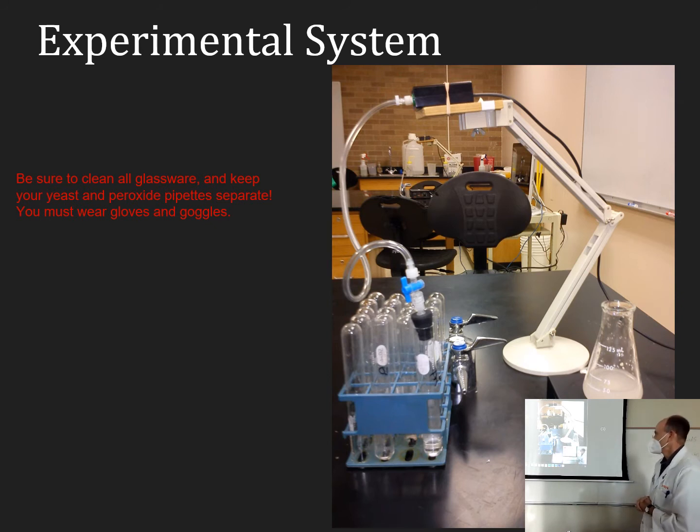That'd be exciting. I'm sorry that the blinds are up, but I'll just read to you what it says here. But this is the basic experimental setup today. We have a probe on top of a stand. That is a probe that records pressure.